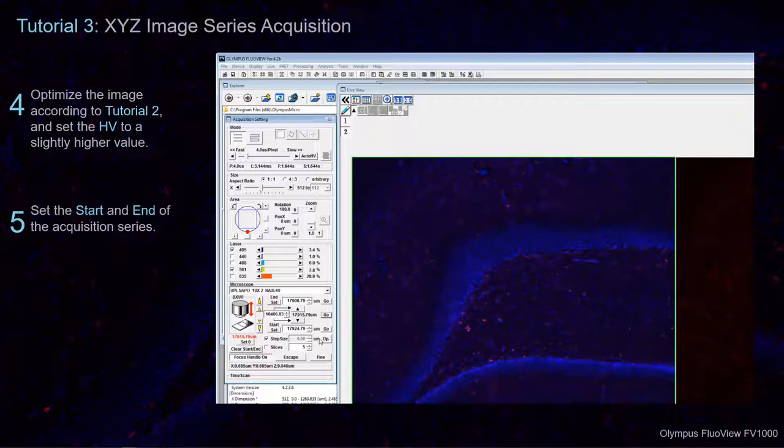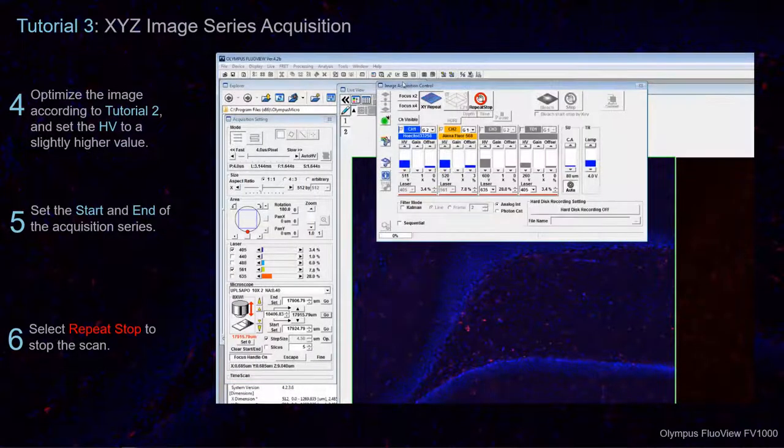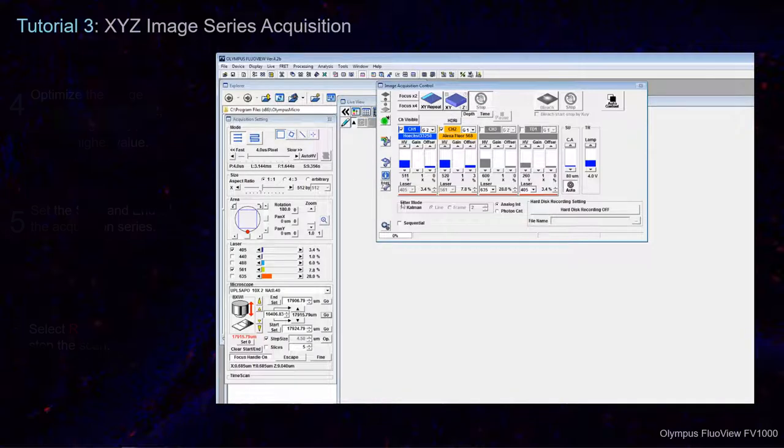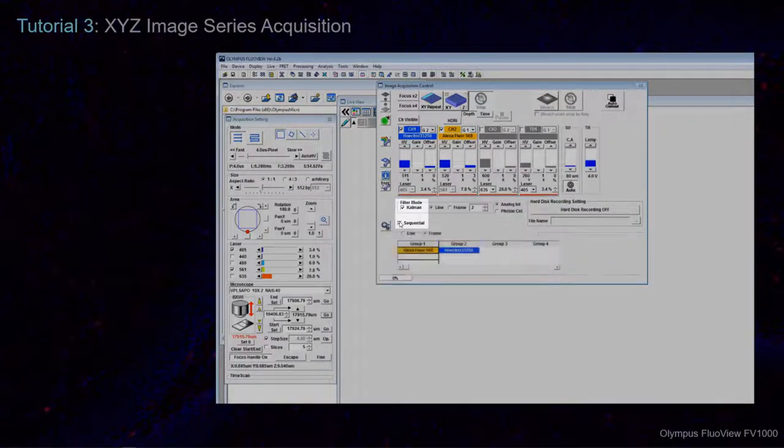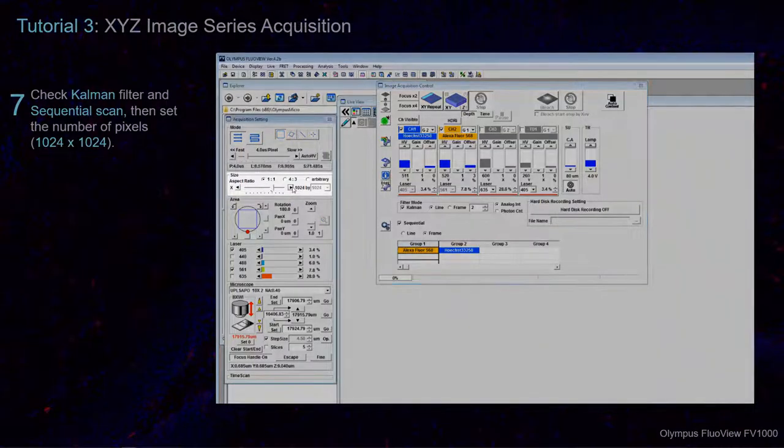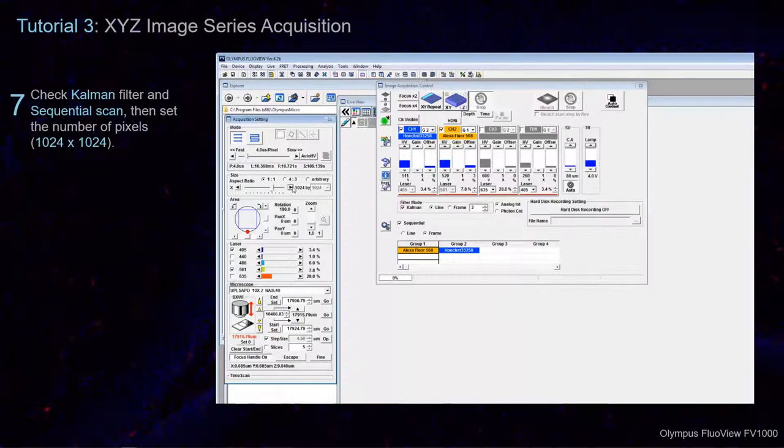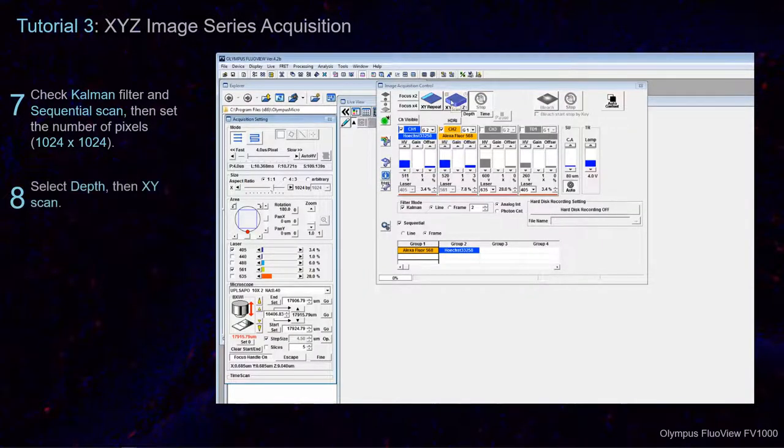Navigate to the Image Acquisition Control window and select Repeat Stop. Check the boxes for the Kalman Filter and Sequential Scan in the Image Acquisition Control window. Change the number of pixels to 1024 by 1024 in the Acquisition setting for Size.